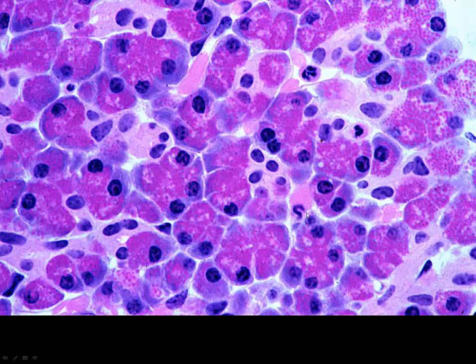We also see a lot of blood cells. We see some polymorphonuclear leukocytes present in our capillaries. They're going to be nourishing this tissue, so we will see quite an extensive capillary network.